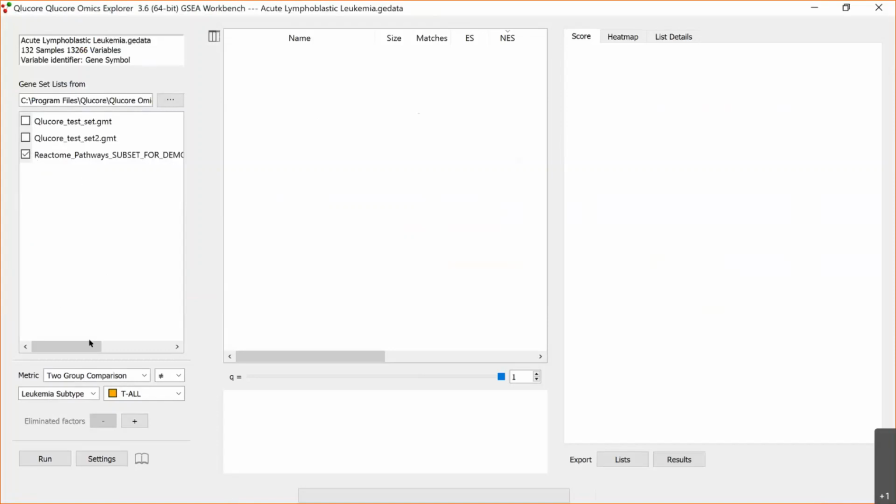And then we go down here, and here I must select the metric that I want to use. So it picked the one that I used in my statistical dialogue, and that's what I want to use. As you can see, I have all the other standard tests available, plus the signal to noise ratio. But since I'm interested in the genes that are good at separating this group from the rest of the subtypes, Ttest is a good ranking method here. So that's good.